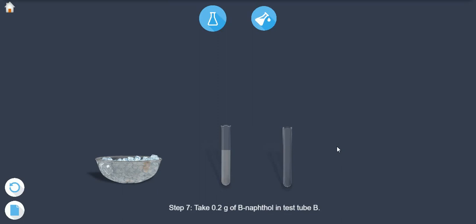Step 7: Take 0.2 grams of beta naphthol in test tube B.